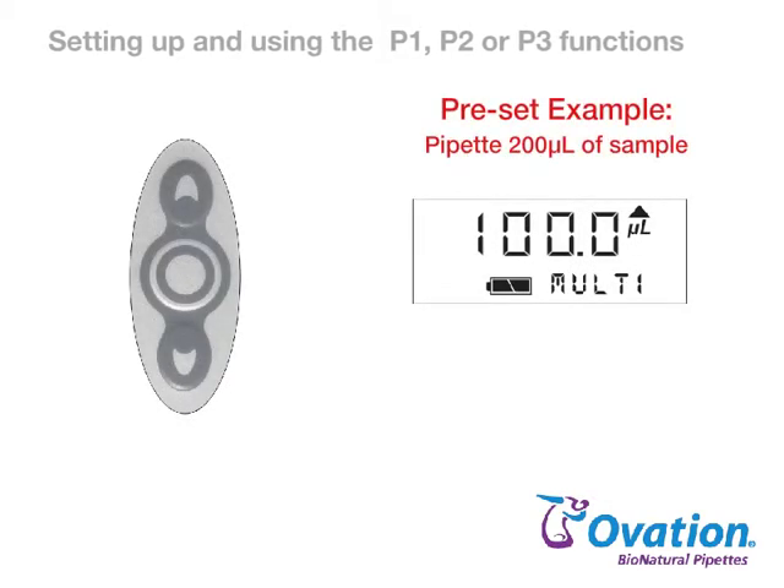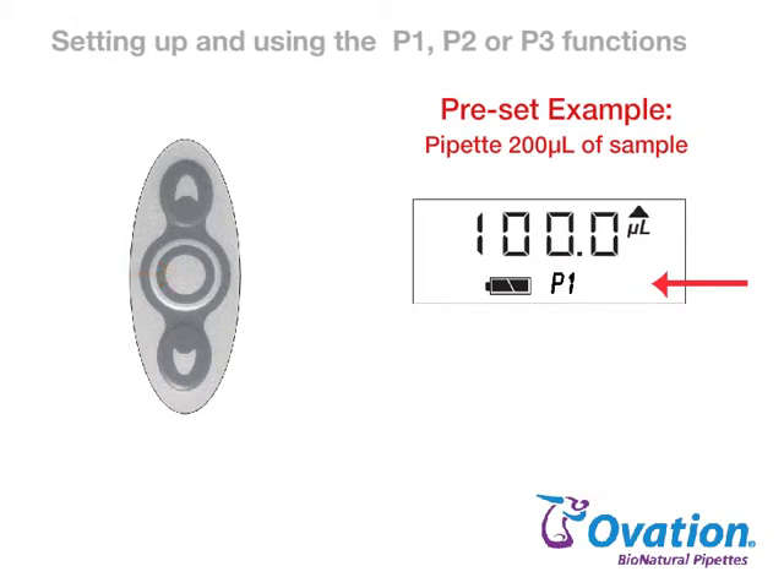For this example, we will program a preset volume for 200 microliters. Begin by pressing and releasing the center button until P1, P2, or P3 appear on the display.